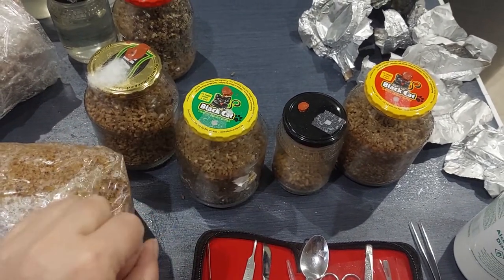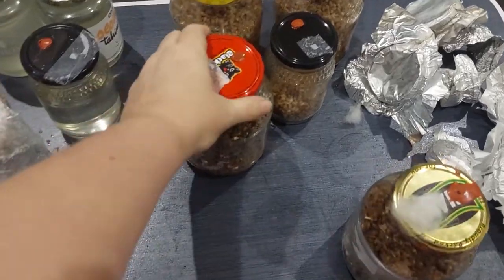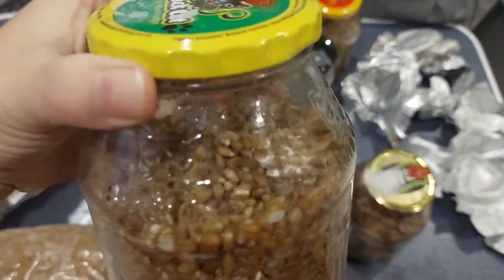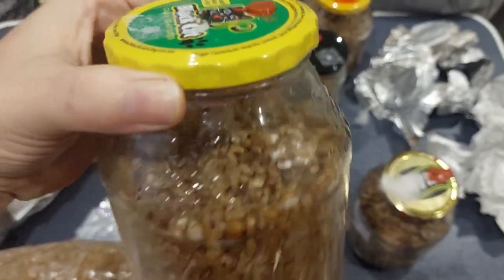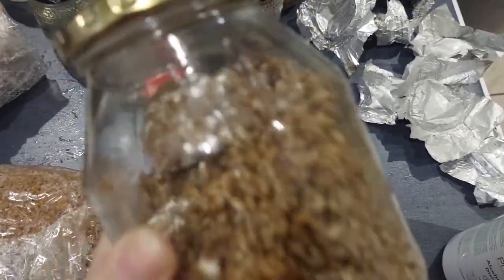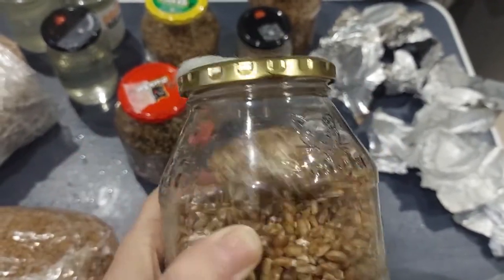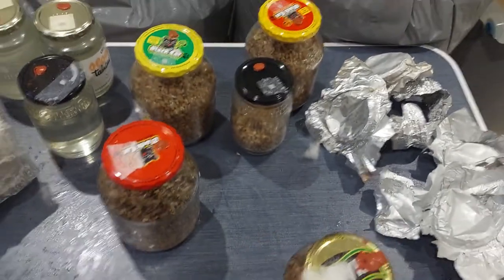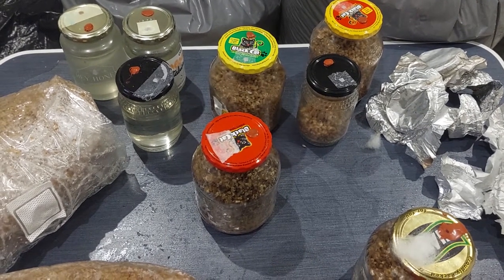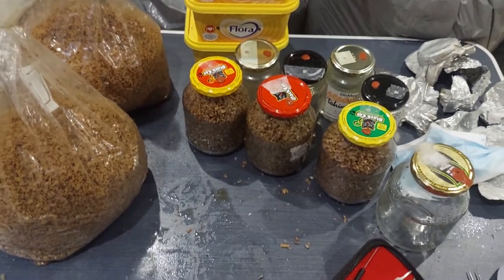Next we're going to do our grain spawn, because we want to limit exposure to contaminants as we go. The grain spawn is done — I wasn't able to get as much in there as I'd hoped, as there were huge chunks at the top that weren't letting any other grain spawn pass. I didn't get as much in as I would have liked, but I still have a few more items to inoculate, so hopefully that will be enough.